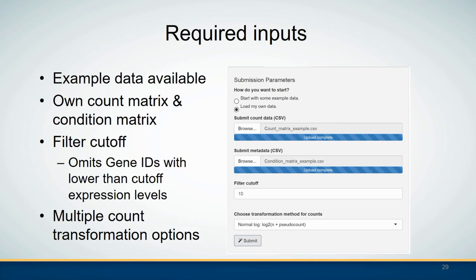In IRIS, example datasets are provided for users to explore the functions. The required inputs from users are a count matrix and a condition matrix. Users can also set up a filter cutoff to omit genes with lower than cutoff expression levels — the higher the filter cutoff, the fewer genes will be kept in the following analysis. The user can also set the transformation method from a dropdown list.